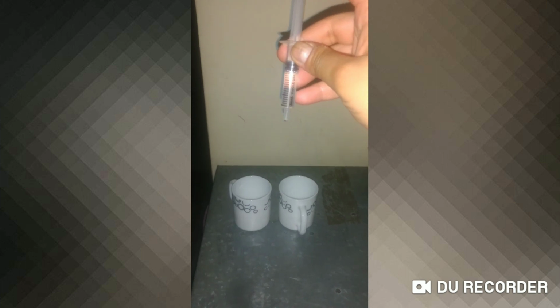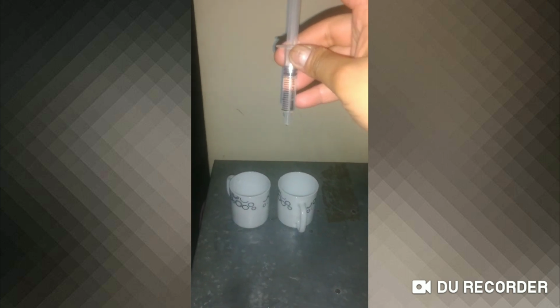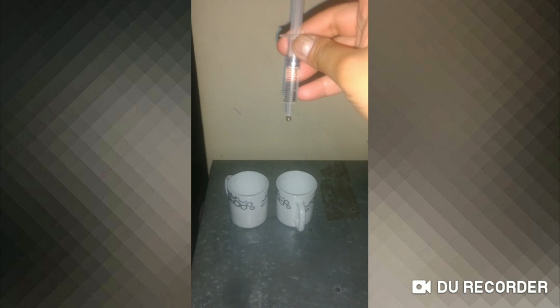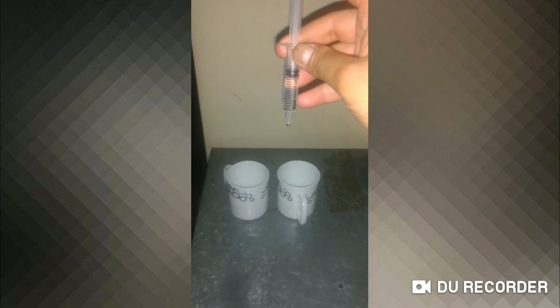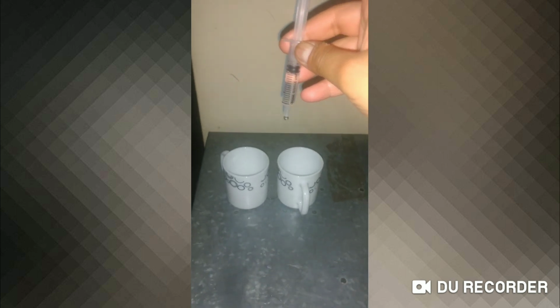Okay, so we are back. What I was telling you is that we'll be using a syringe like this and suspending a little drop of water right over here. I'm letting a lot of water fall down, that's not cool. I should let that fall. A very little drop of water. This is enough, and we will be keeping this.